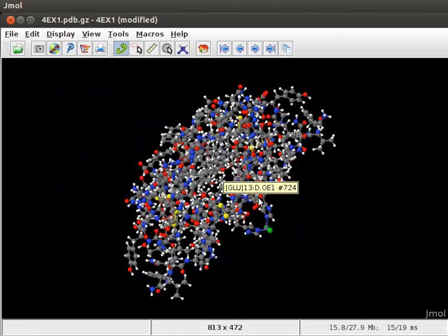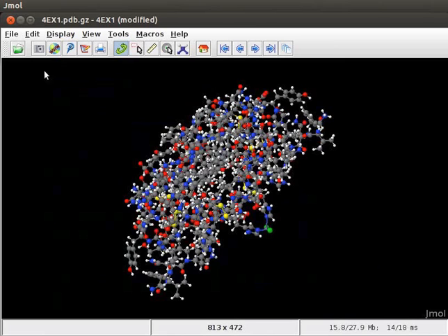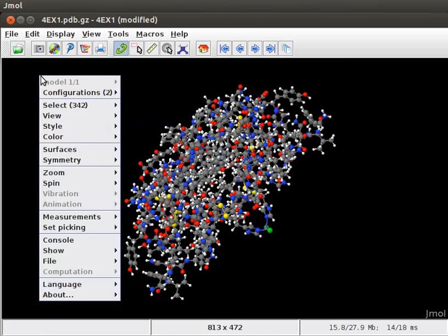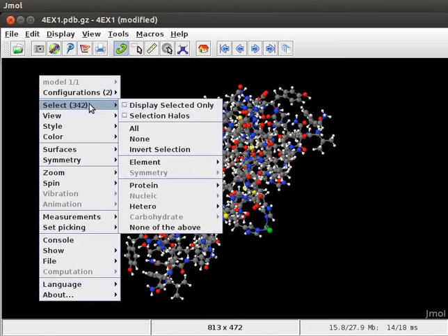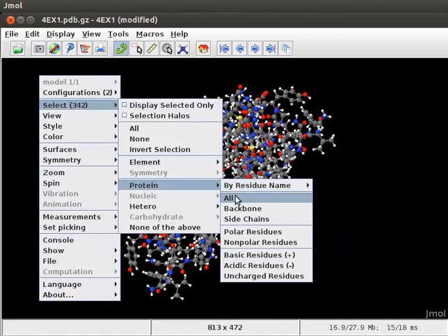Next, let us learn to display the secondary structure of the protein in various formats. Open the pop-up menu. Go to Select option. Scroll down to Protein and click on All option.